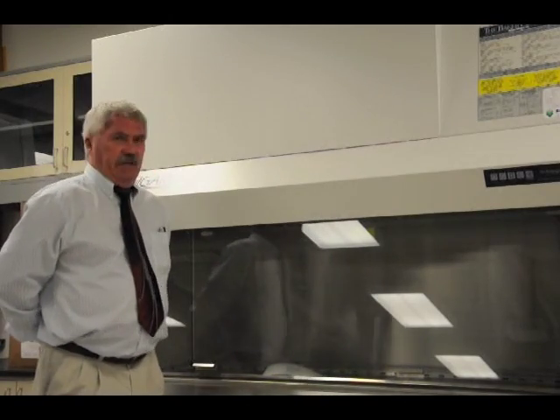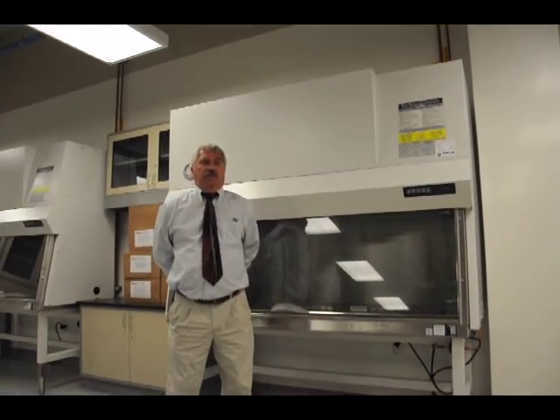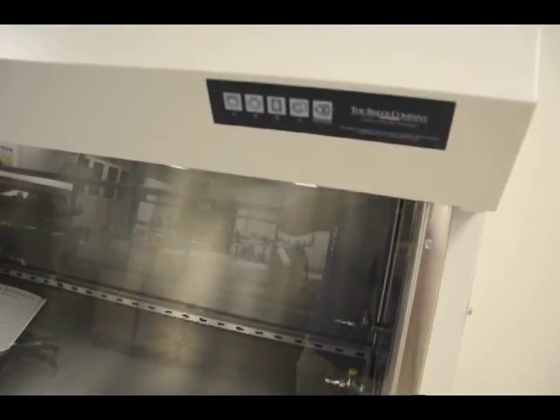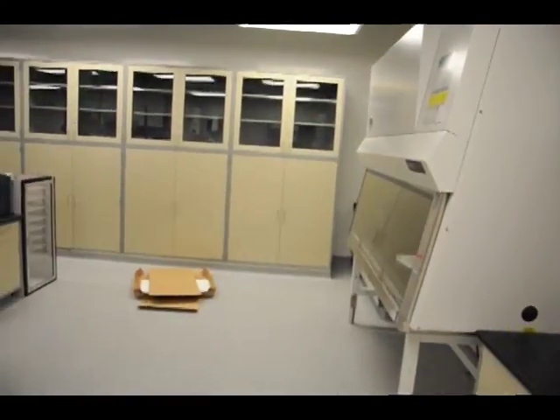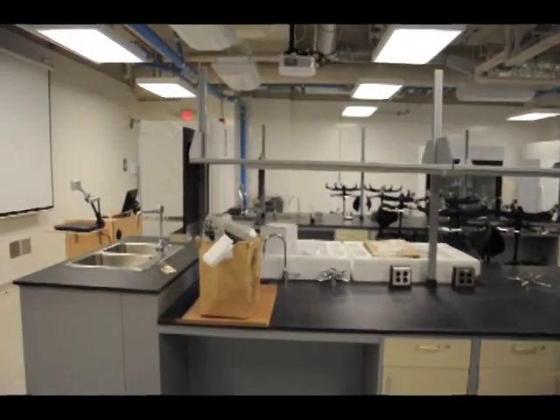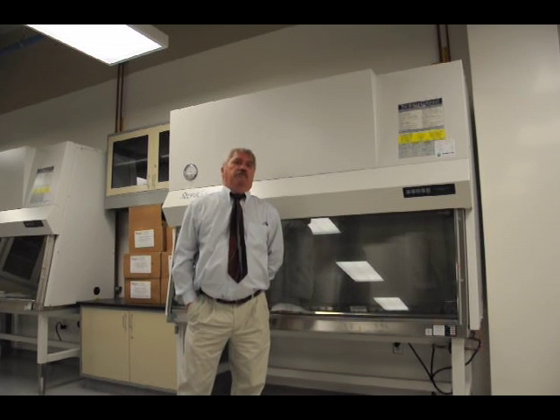Again, I'm standing now in the tissue culture lab, or future tissue culture lab, down on the first floor of the B-Wing extension. Behind me, we've got a Biosafety Cabinet in which all the work with the biologicals will be done. There will be no handling or exposure of working biologicals outside of this cabinet. Everything else, preparation of chemicals and media and that sort of thing can take place outside, but handling the biologicals will have to take place in here. Unless, of course, you're looking through the tissue culture flask using a very low magnification microscope just to get some idea of cell density.